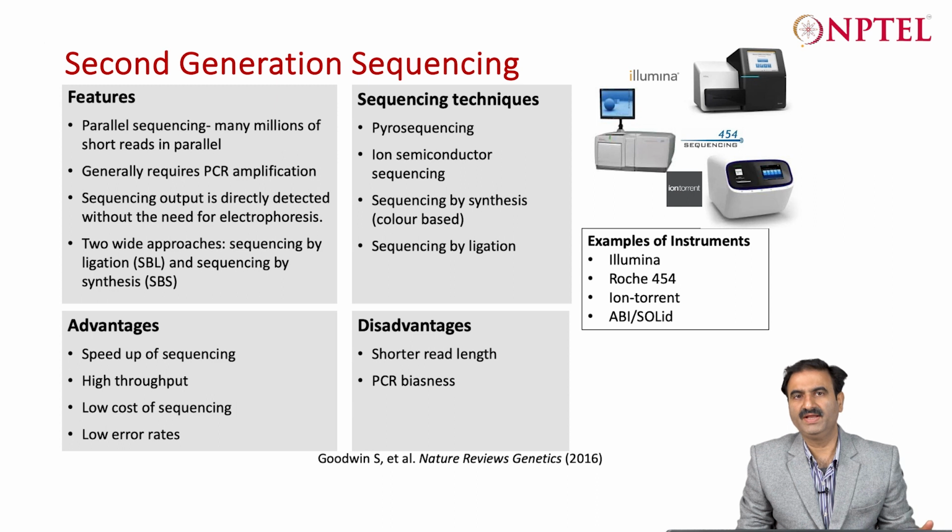The link reads that we are going to see today are short reads produced by any of these short read technologies, but the library preparation is done by the 10x Genomics Chromium instrument, right?